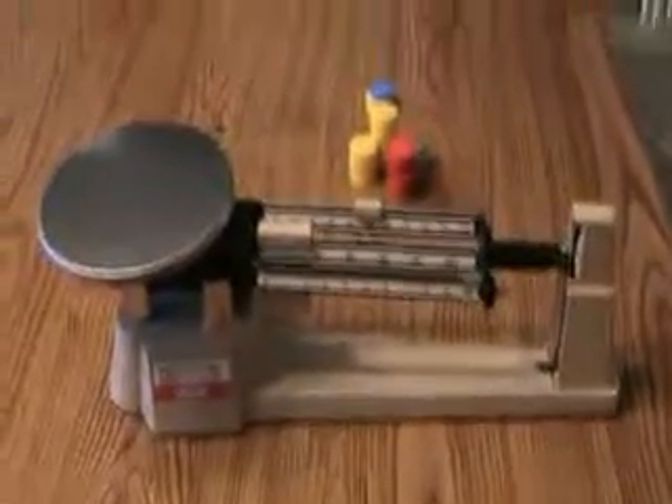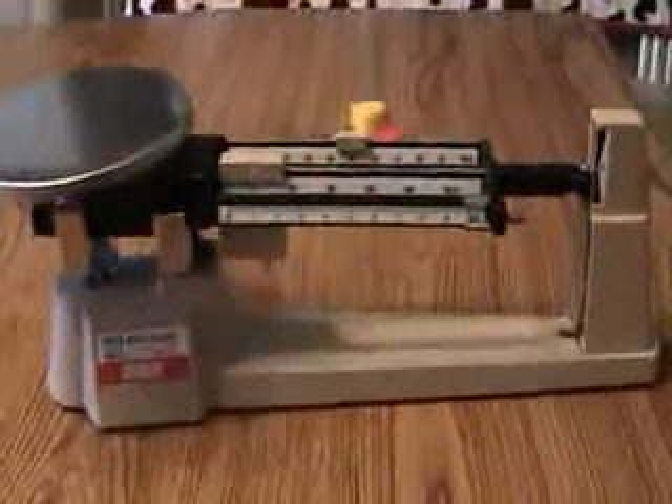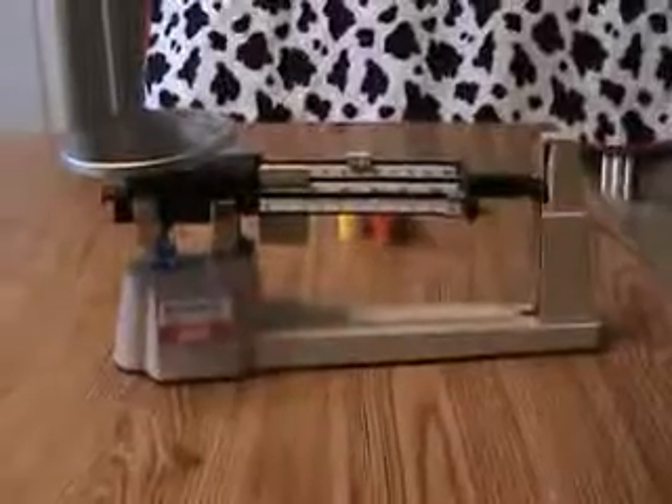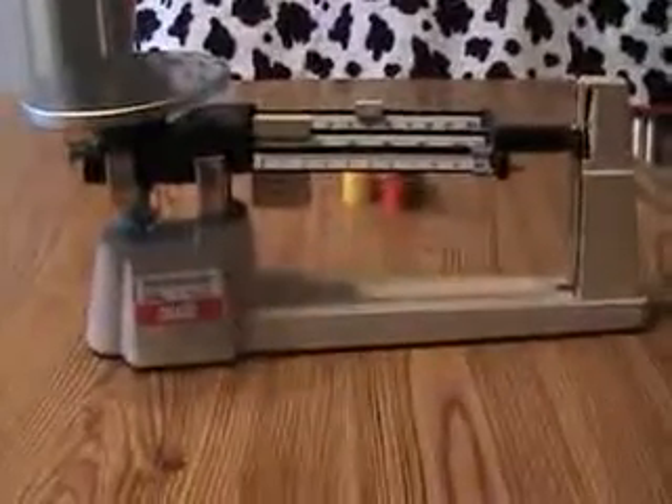Welcome to Chatterton Helping Hands. In this edition, we'll be focusing on how to use the triple beam balance. The triple beam balance is used to measure mass. Mass is the measure of the quantity of matter, basically meaning how much of a substance there is.